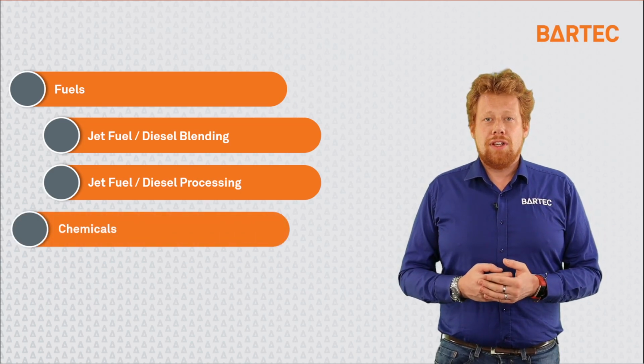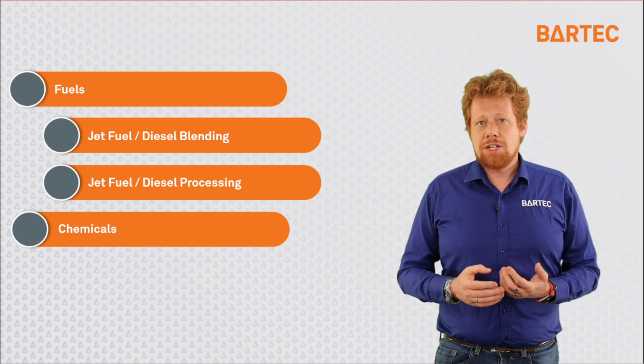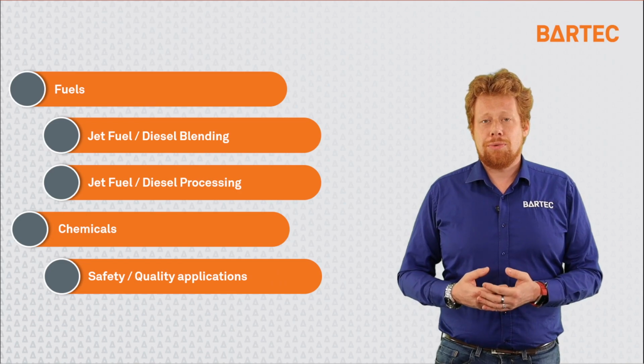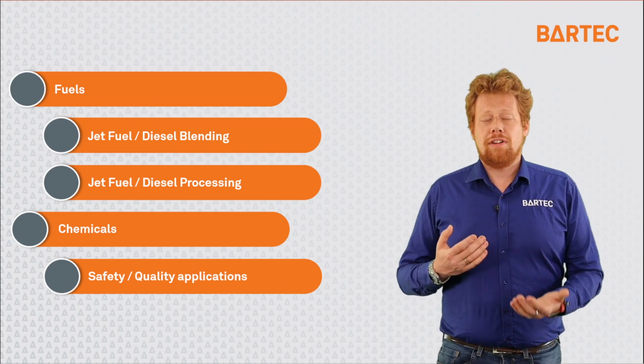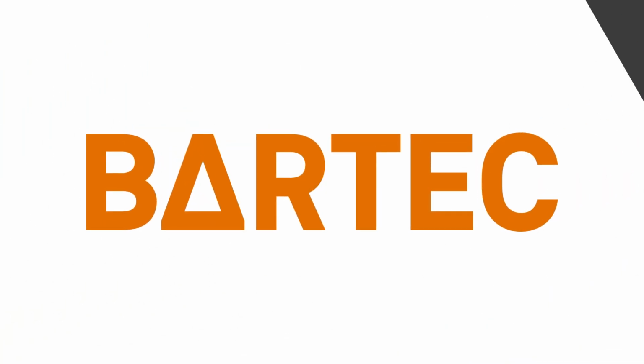Another field of application is in the chemicals industry, where we will see flashpoint measurement for quality control and safety applications related to, as I said earlier, flammability and combustibility of sample.